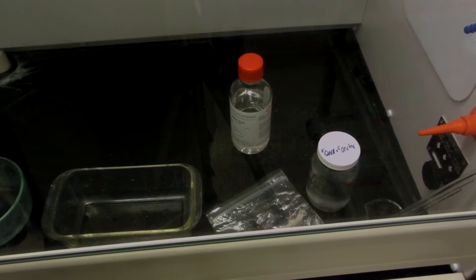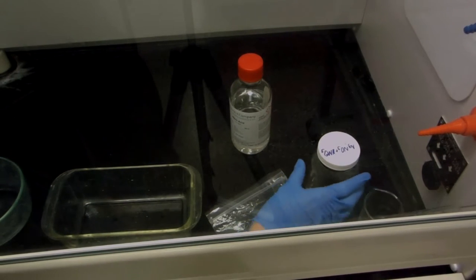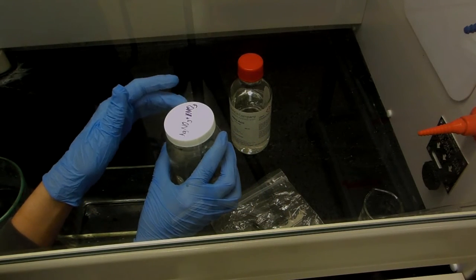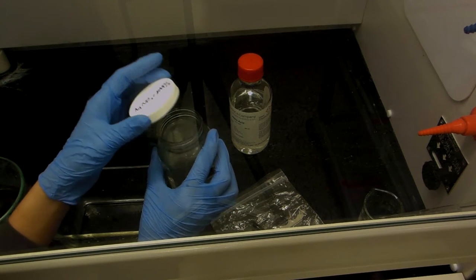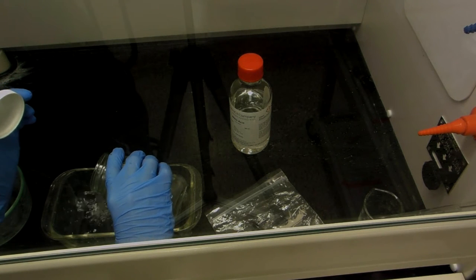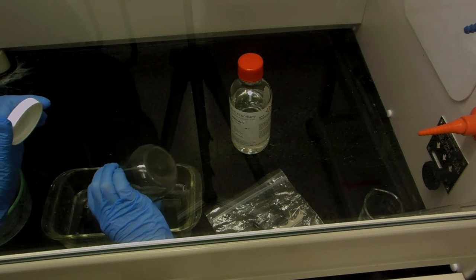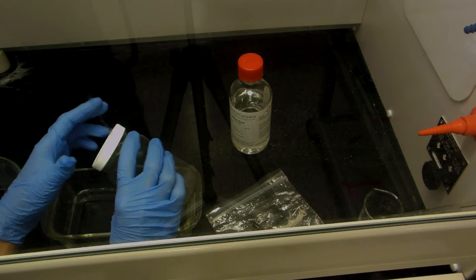So now I made a solution of nitric acid by using a 1-to-1 ratio of nitric acid and water. Now I carefully remove the cap that has the solution on it. I'm in an awkward position, so it's kind of hard, but I got it eventually, and I pour the contents into the rectangular container. And I replace the cap. Put that down.